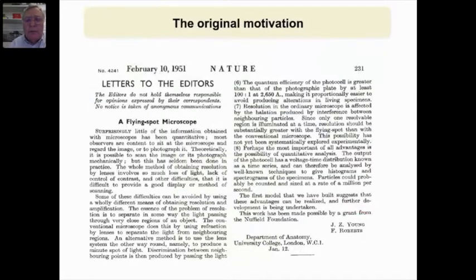And I think the answer is probably this 1951 paper by J.Z. Young and Frank Roberts, where they started to speak about a thing called the flying spot microscope. And in the first paragraph, they make the remark that surprisingly, very little of the information obtained with microscopes has been quantitative. Most people are happy to sit at the screen and stare at the image, but rarely have people really tried to get anything quantitative out of the instrument.